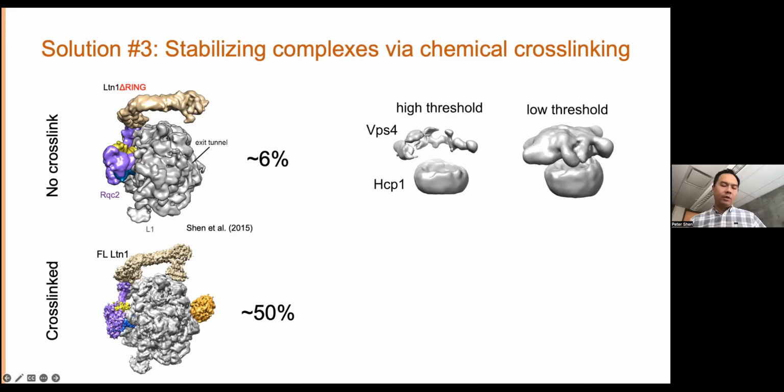And so I would say that we're at a point now where every cryo-EM project that we embark on, we always include some level of glutaraldehyde-based cross-linking. I understand the caveats that it's not perfect, but I do see it as a necessary evil as long as we're using these blot-based plunge freezers where particles are constantly getting shredded by the air-water interface.